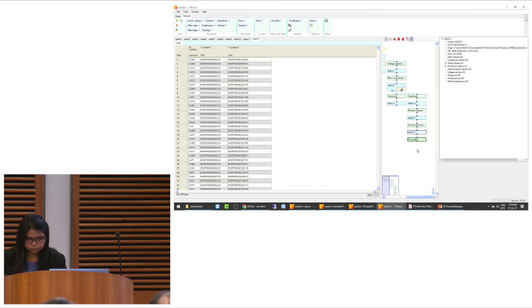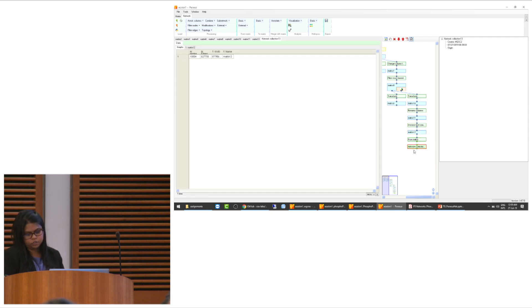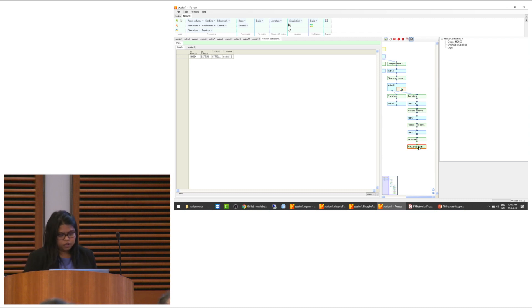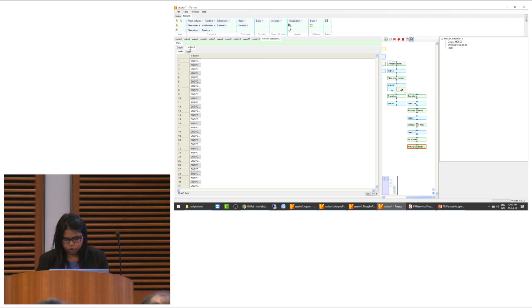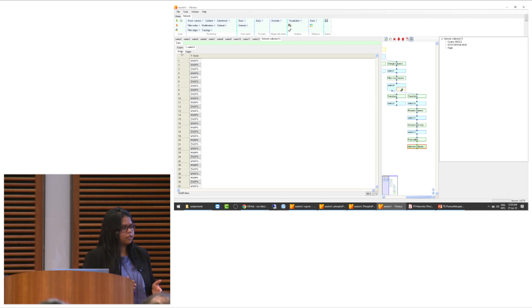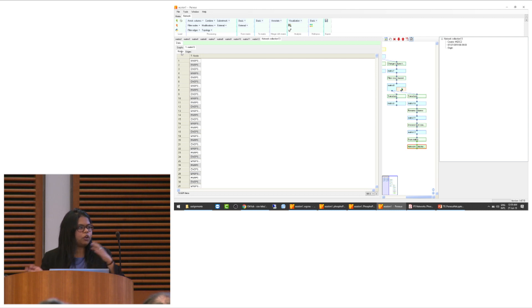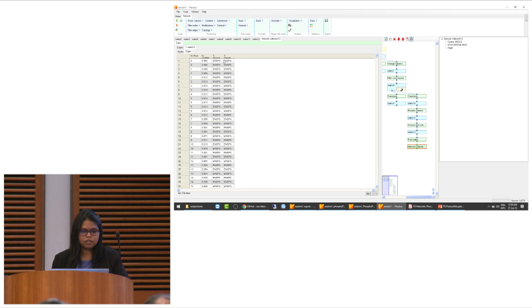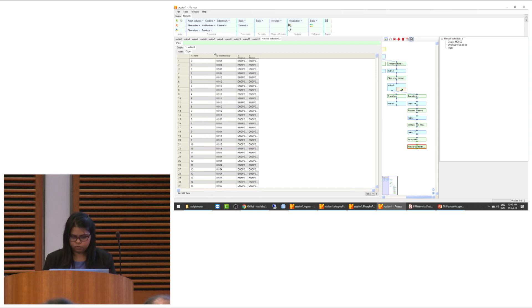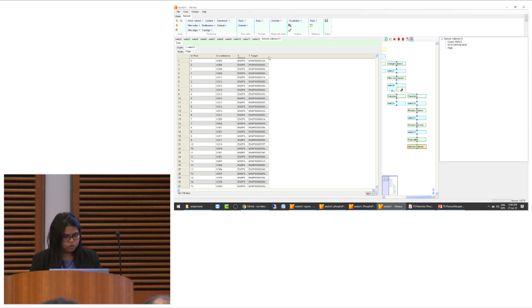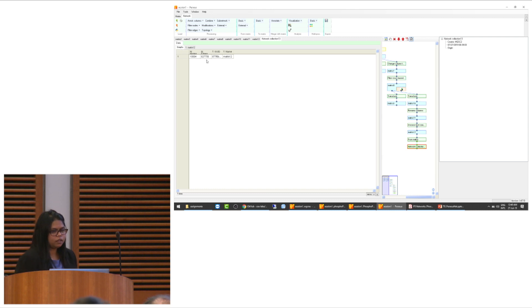Now it will be easier to map with your experimental dataset. We can convert this into a network and view it as a network. In Perseus, we have given the network in tabular form, and you'll see two tables: nodes and edges. There is a Network tab next to the Matrix tab where you can convert your matrix into network form, and you can also go back from network to matrix.